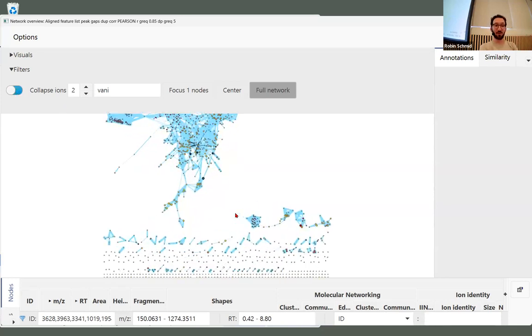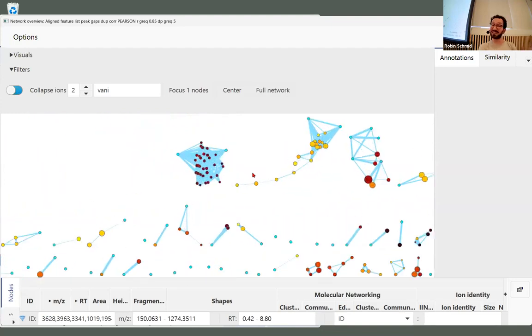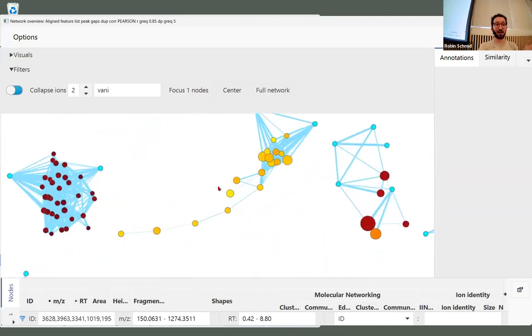So the networks look very messy, right? But in my view, this is more the relationship within your data set, that many things are similar to many things. Again, the cosine similarity threshold that we used was 0.7. If you decrease that further, it's going to be clustering even more, but you could also increase it, and we try to make it easy to apply.